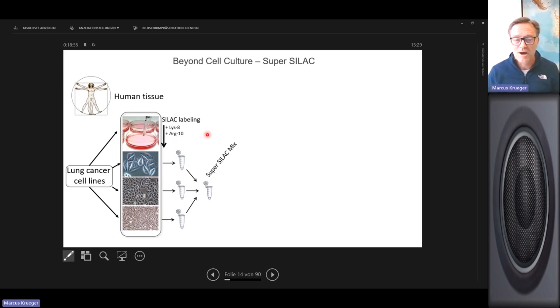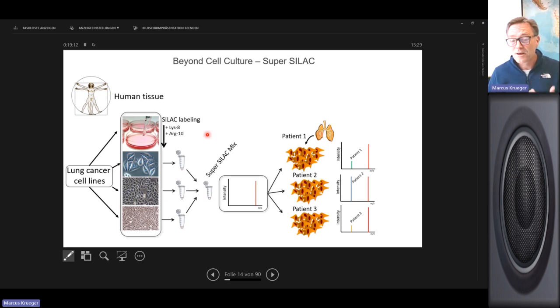So the idea behind that is that you increase the proteome, or the peptides and proteins, which are heavy SILAC labeled, to get a wide proteome. This is just a control, that you have a heavy proteome of 3 different cell lines, and then what you could do is spike this heavy labeled proteome from cell culture into the patient lung carcinomas, right, in different patients.